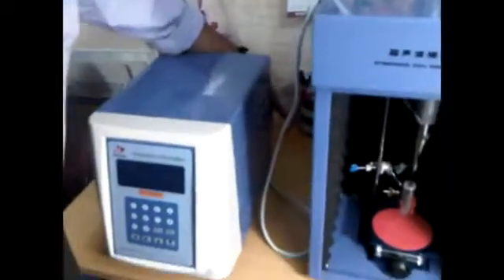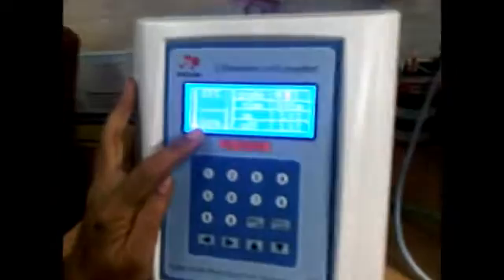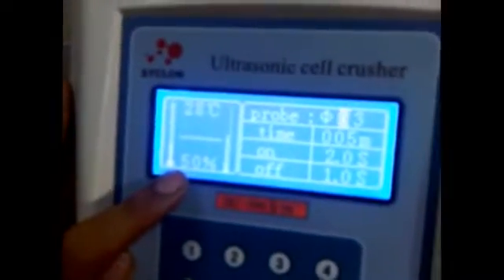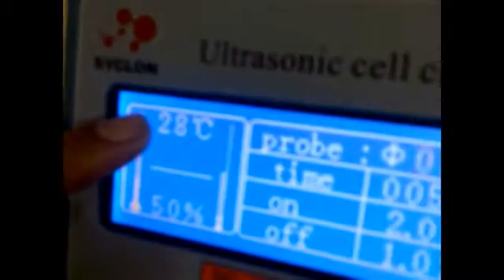Now we are coming to the generator part. We have put the power on from the back. Here you can see some display is coming. Let us go through these. This percentage shows the percentage of the power. This 28 degrees centigrade is the temperature that the temperature sensor is sensing at the moment.